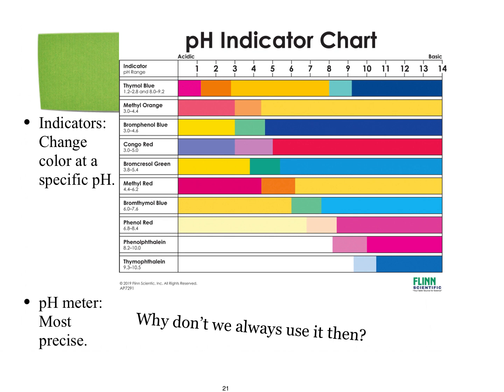The two most common that we use in class are phenolphthalein, which is really cool because it stays clear in an acid and then turns pink as soon as it reaches about a pH of 8. So this light pink color will start to develop at a pH of 8 or 9. You're adding base to your acid and it's staying clear and staying clear, and then you add a few more drops of base and all of a sudden the pink color shows up and it stays, and you know you're at about a pH of 8. This one is going to be used most often. It is by far the most common pH indicator that we use.